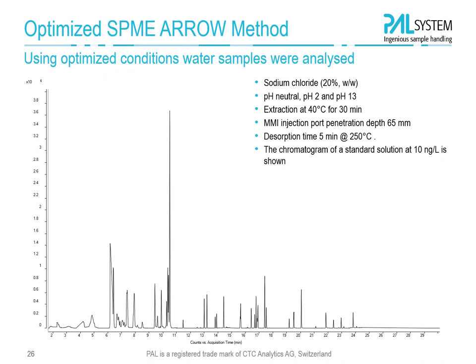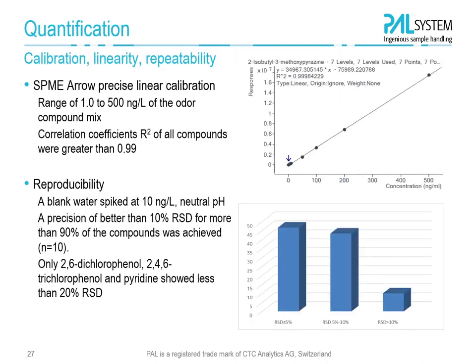Finally, when all discussed parameters are optimally in place, we get such nice and also sensitive chromatograms. This quality for sure is needed for a solid calibration and quantitation.